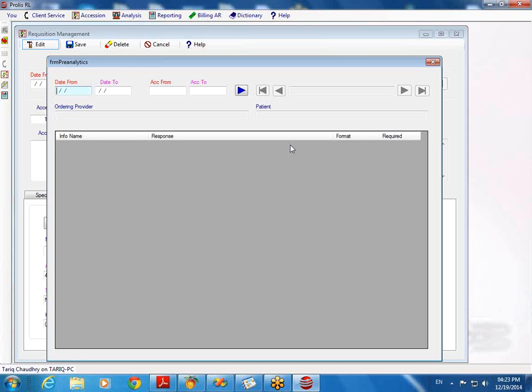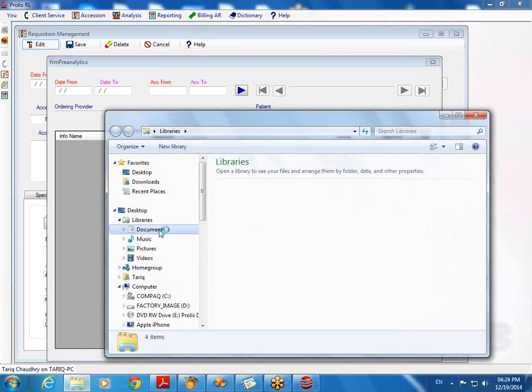So we support both kinds of techniques, conventional pathology and synoptic pathology. If you acquire the system, we will tell you how to take the modern approach and how to use the conventional approach, the way you want it. I can show you. Let me recall the accession we have created for that purpose, synoptic testing. Let me pull some report for that and show it to you, what I mean.